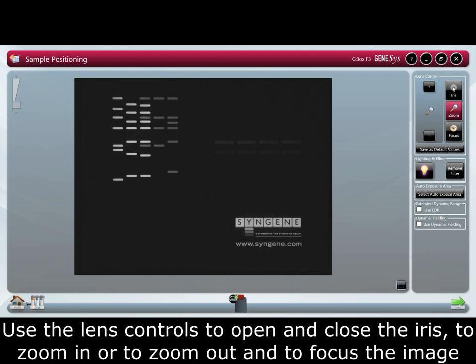Use the lens controls to open or close the iris, to zoom in or to zoom out, and to focus the image.